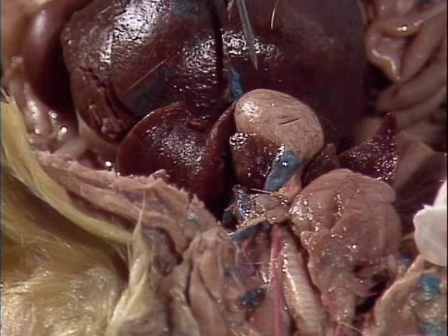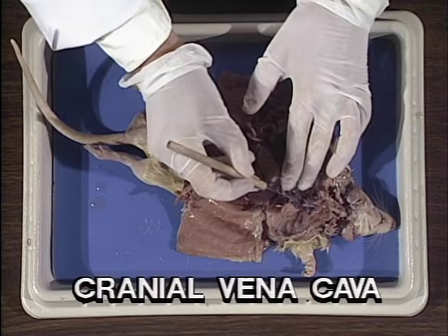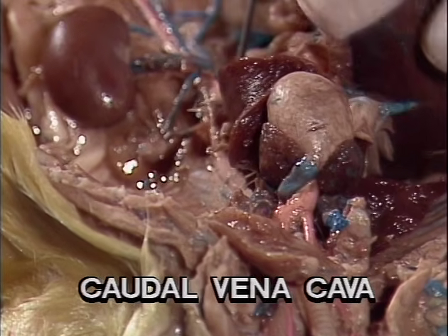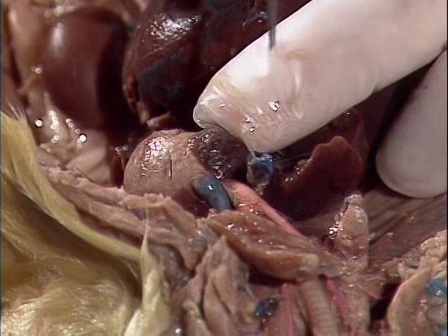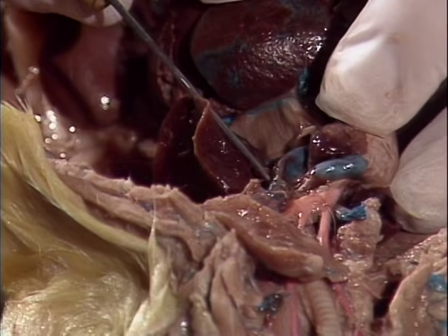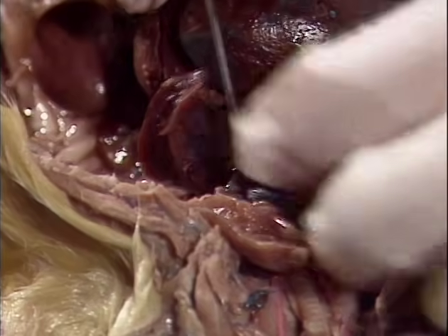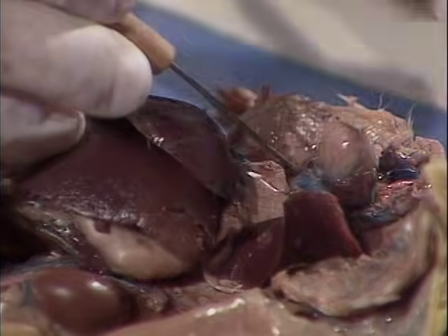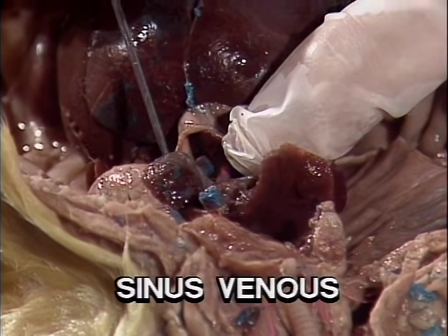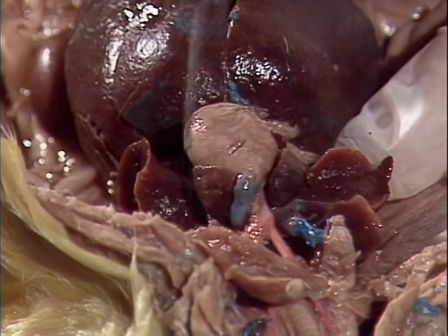Two major veins return blood from the body of the rat to the heart. They are the cranial vena cava and the caudal vena cava. The rat is unique in the fact that it has a right and a left cranial vena cava. The left vena cava curves around the underside of the heart and joins up with the right vena cava at the sinus venosus. There are 5 major veins that empty into the cranial vena cava.